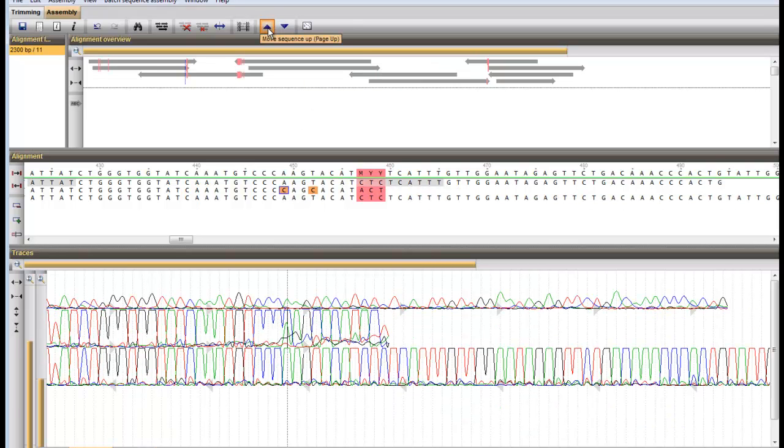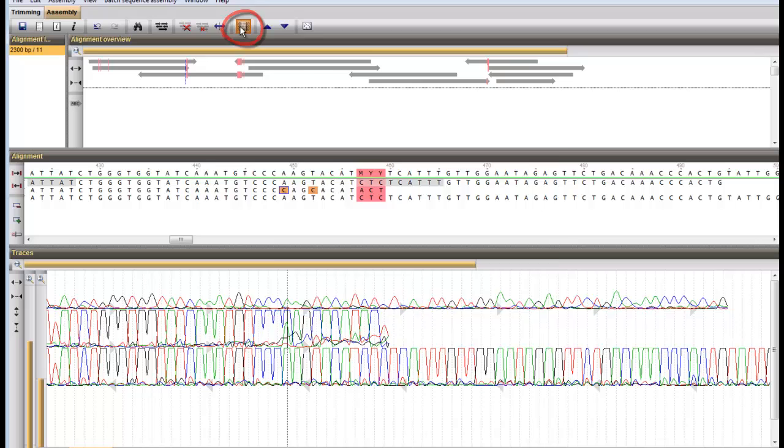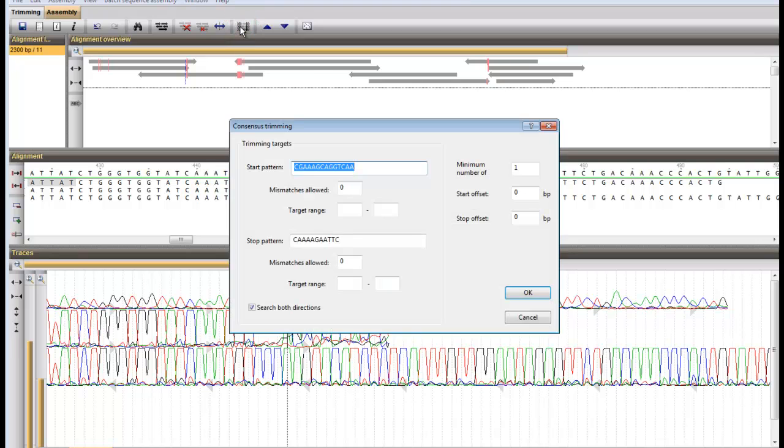Possible primer ends can be trimmed off the consensus sequence. Press the Consensus Trimming button to enter the target patterns to look for.